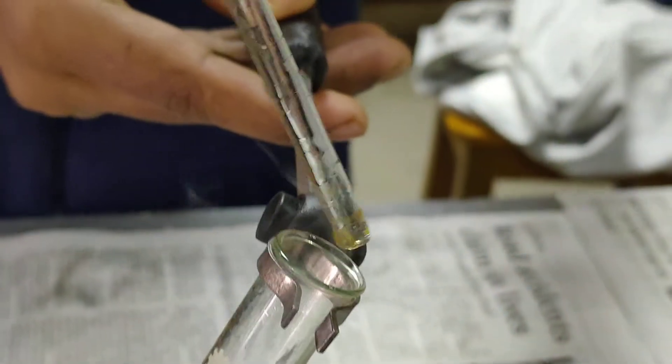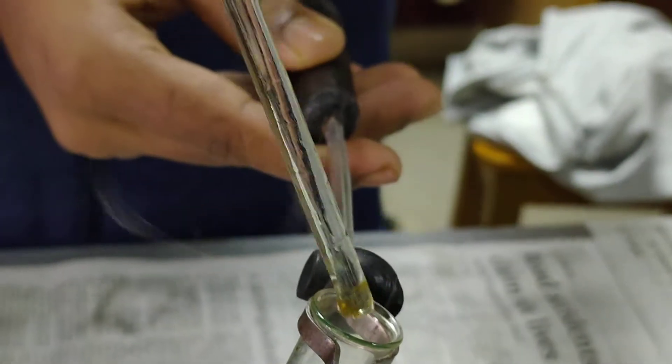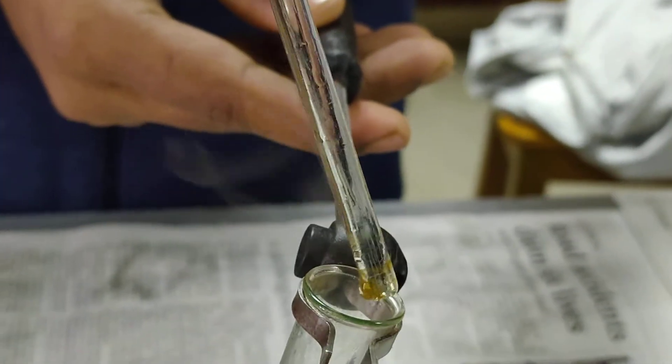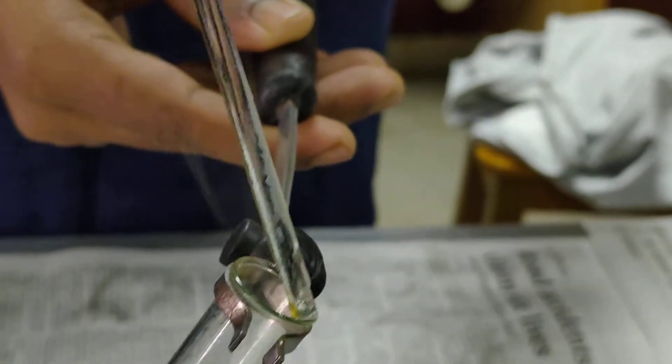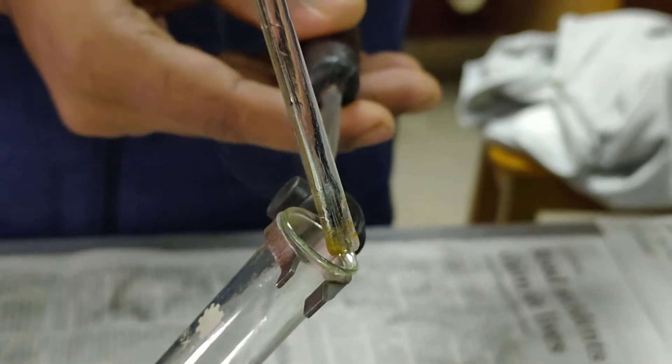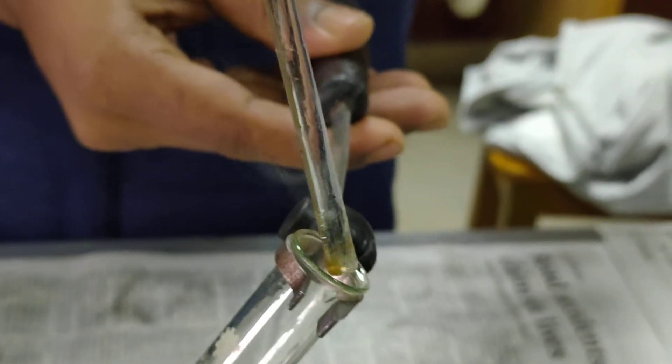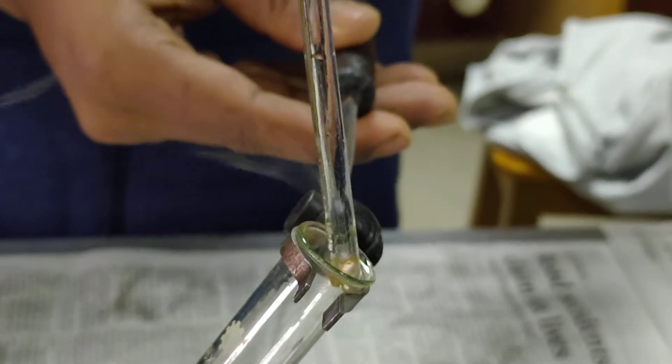Whenever a hydrochloric acid dipped glass rod is placed at the mouth of the test tube, it is producing white fumes. This white fume indicates the presence of ammonium. This is the white fume of ammonium chloride.